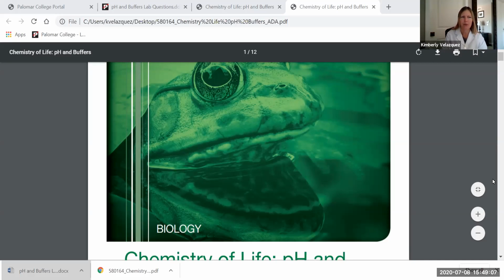Hi, today I'm going to tell you about the Chemistry of Life pH and Buffers lab. I'm going to walk you through the instructions, and then I'm going to show you some of the equipment and materials you'll be using to do the lab. I won't show you the results, but I am going to give you some detailed information because this is a fairly complex lab this week.